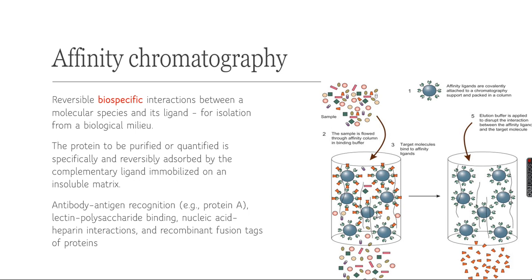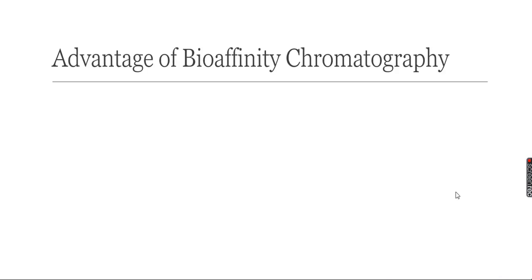So essentially we prepare the ligand-attached support material, we load our sample, and we clean, or wash, away the unattached biomolecules. Then we release the target with some elution buffer, which comes out from the column, and this is the final step for recovery. This is the procedure normally adopted.